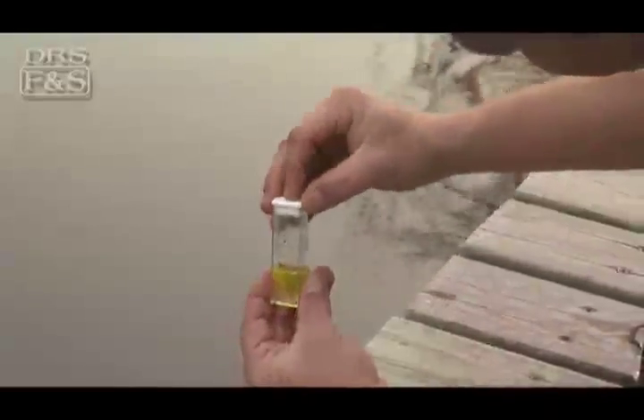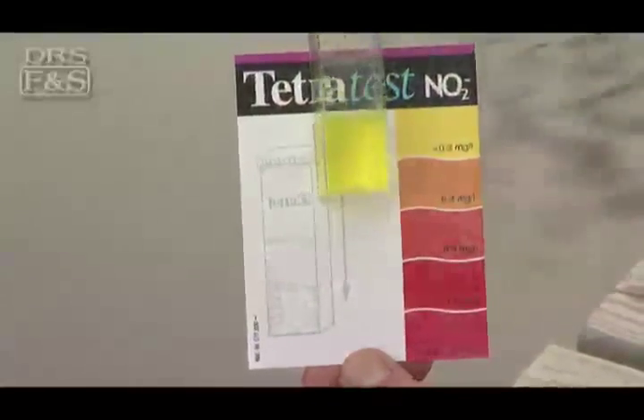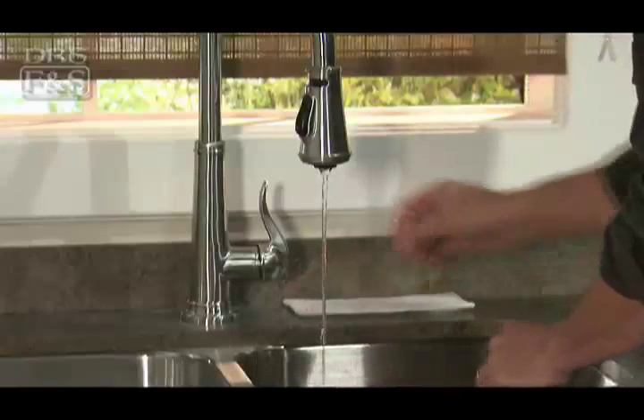Wait for the color to develop — developing times will vary based upon test type. Check your results against the color chart included with your test kit. When you're finished, rinse out your vials and air dry.